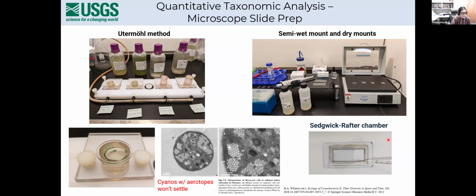You can't go higher than that, and that's really not sufficient to make accurate identifications. So we can use it on the inverted scope. However, now your objective is looking through the bottom plate, which is a lot thicker, and you can adjust the aperture on your objectives to get a clear image. But at least on my scope, with the 60x, even adjusting the aperture on the objective, things are still a little blurry.